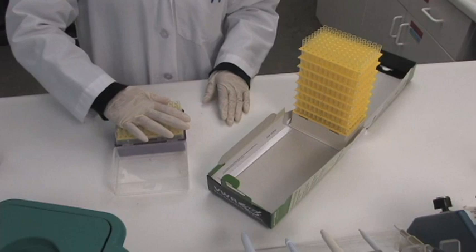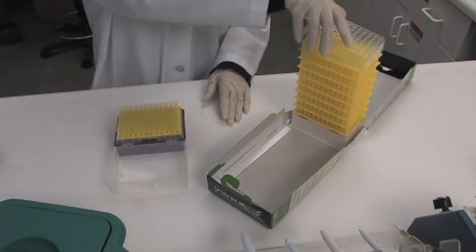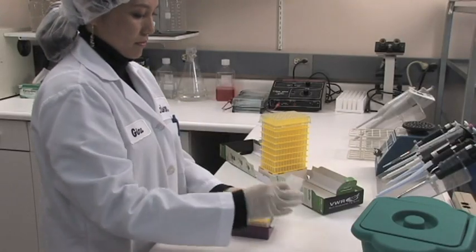With a simple lift, place, and snap, you can refill empty pipette tip racks with over 17 styles of tips.